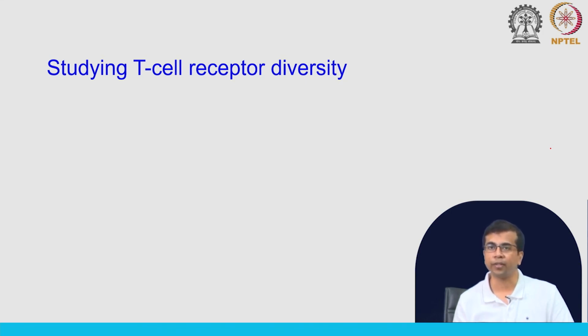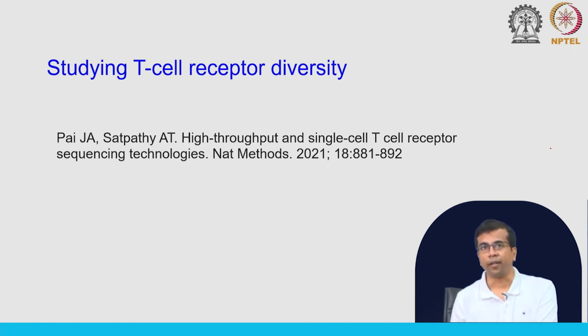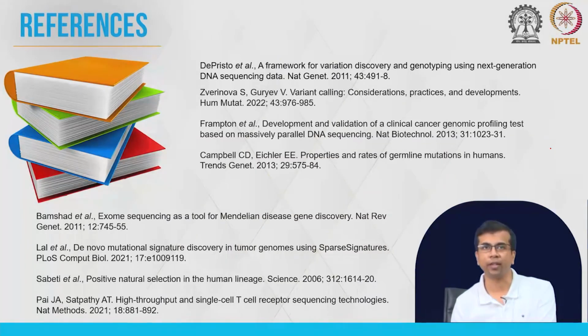So, with next generation sequencing combined with variant calling, you can study this T cell receptor diversity in great detail.